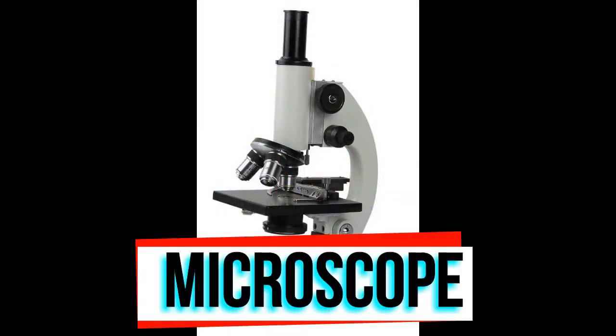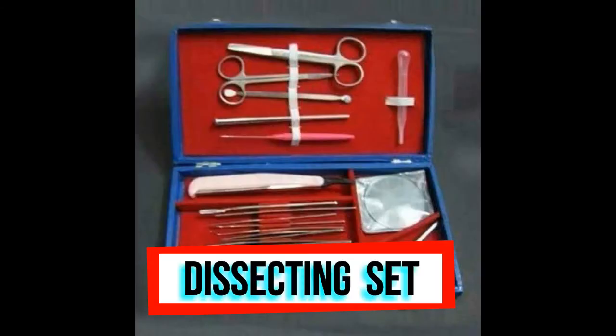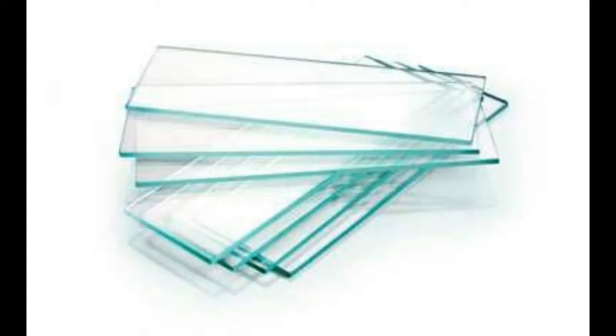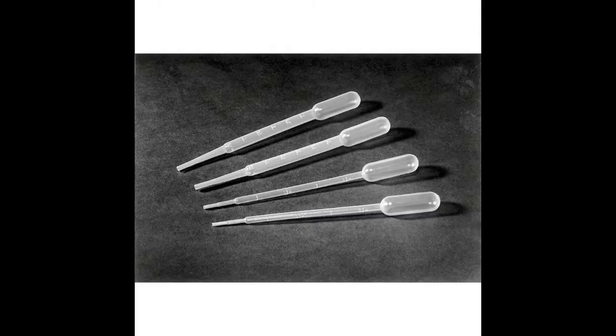This is a microscope. This is a dissecting set. This is a sampling bottle. This is a cover slip and glass slide. This is a Pasteur pipette.